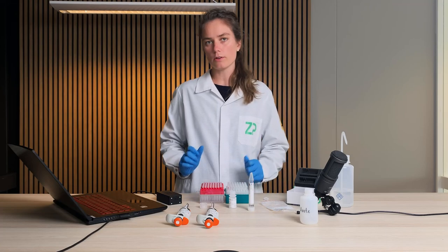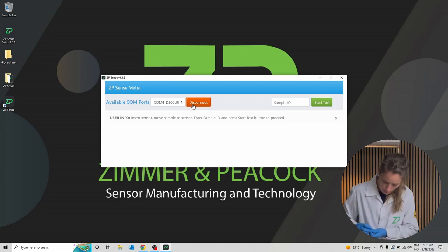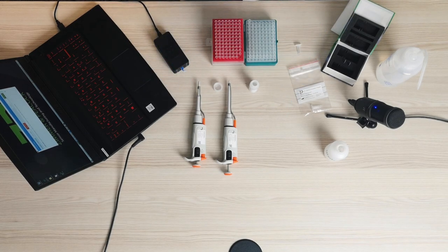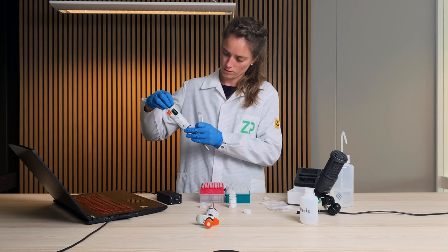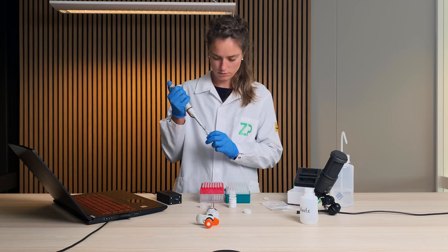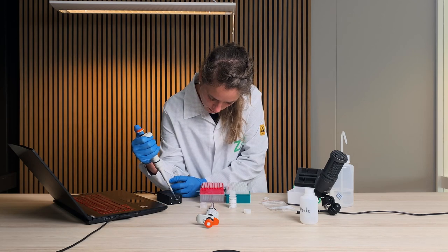Now I will follow the guidelines of the application. It says to insert the sensor, so I'll insert the sensor into the meter like this. Then I will pipette 40 microliters of the testing sample onto the sensor. Be sure to cover all the electrodes of the sensor and be careful not to scratch the surface.